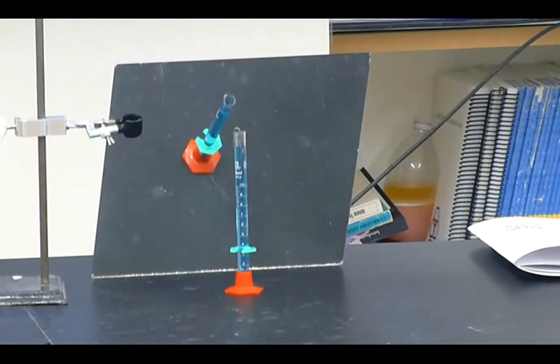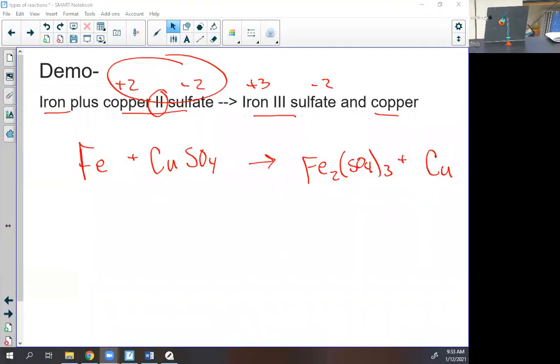Okay, I've heard one guess. The brown stuff is rust. Any other guesses? Everyone agrees that it's rust? Well, you shouldn't, because it's not rust. Nothing against anyone guessing it was rust. Is rust in our reaction? No. Whatever this brown stuff is, it has to be in our reaction. What on this screen are we familiar with that looks kind of light brownish reddish? Copper.